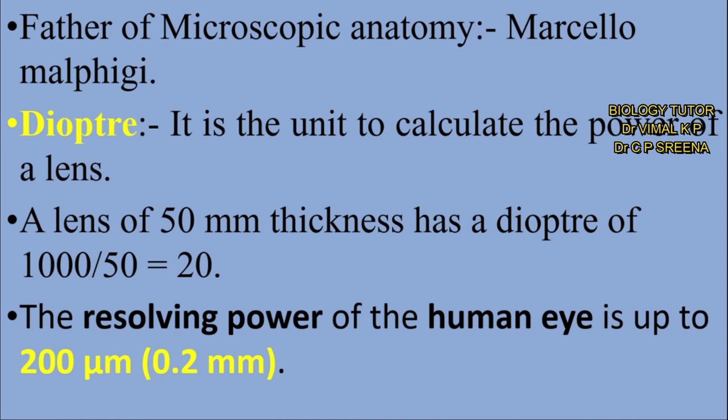The resolving power of the human eye is up to 200 micrometers or 0.2 millimeter. You should remember that particular point.